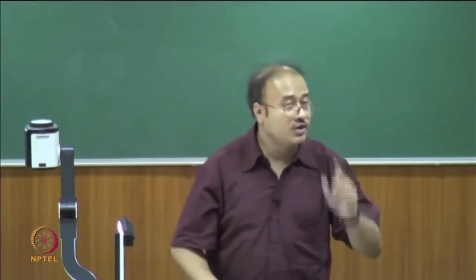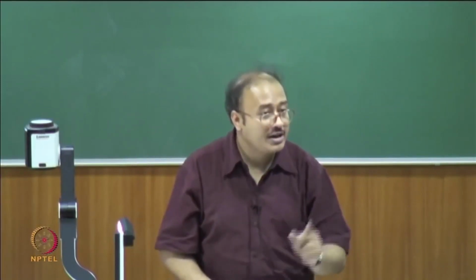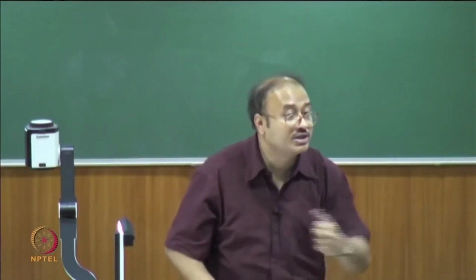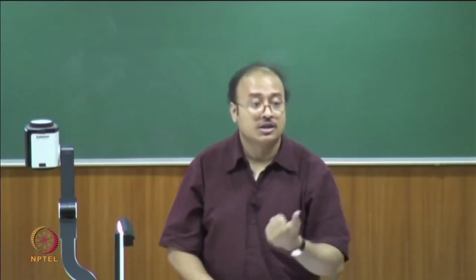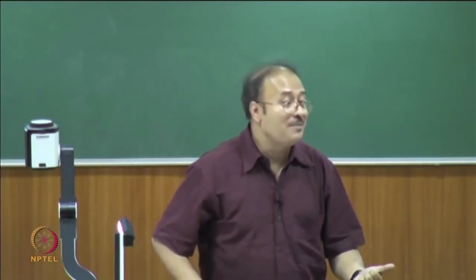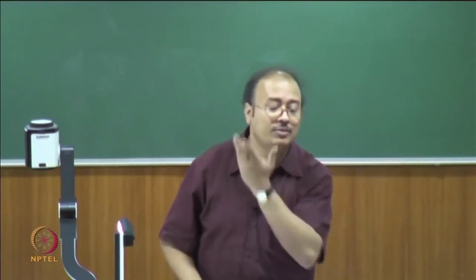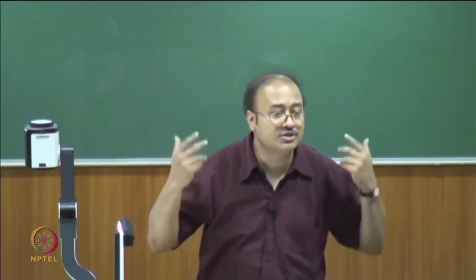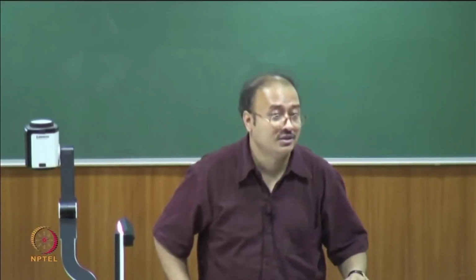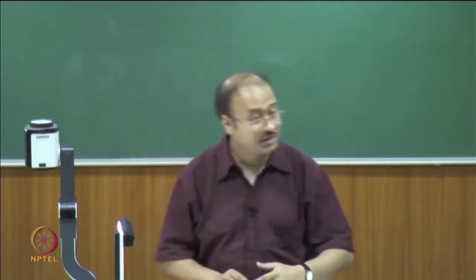Okay. So, you have to understand that if I am going to do this, I better have a laser where cytochrome C absorbs, that means cytochrome C has an absorption band at my laser frequency, because it has to absorb the laser. See, the point is, you can have a very high intensity laser, it does not matter, but if your sample does not absorb the laser light, it will just pass straight through, because it is fully transmissive, there is no absorption at all. The only way you can excite a sample or heat a sample up is to make sure that the sample actually absorbs the light you are passing through, right. That is the minimum you can do.